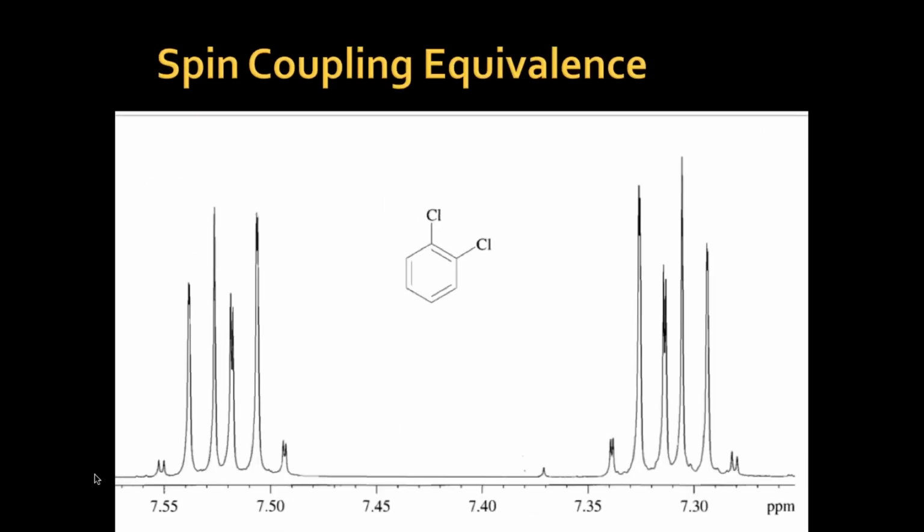Okay, next is from Varun Agarwal. If the molecule is symmetrical, the upfield or downfield position of the peaks is just because of the electronegative group or the different functional group present. Of course, the hydrogen next to the chlorine in this case will show this.